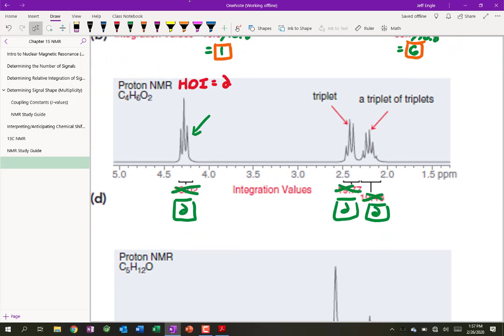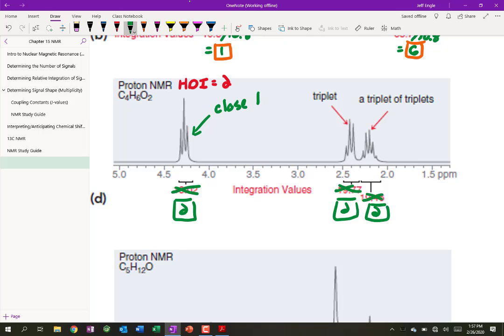So if we look over here, I would say this clue is that it's either close to a very electronegative atom, or it's going to be something like this. All right, so that's a reasonable clue. What do you think, though, based on the fact that we have 2 oxygens? What do you think is most likely? I would say it's probably close to an electronegative oxygen because we have 2 oxygens that we need to account for anyways. So I'm leaning more towards this.